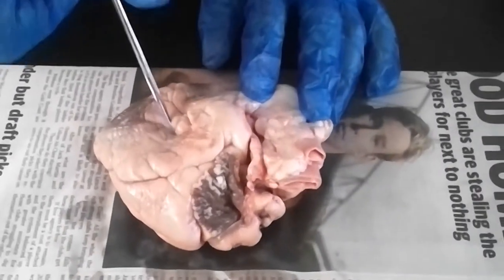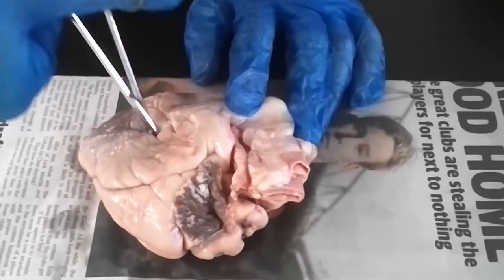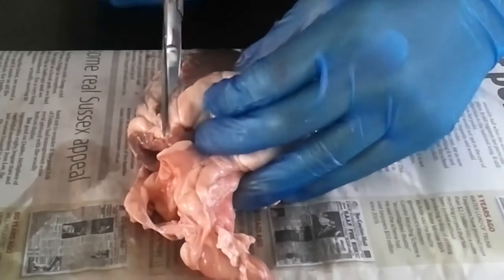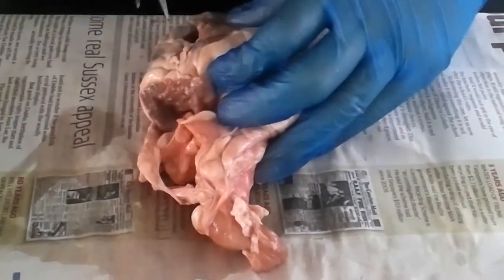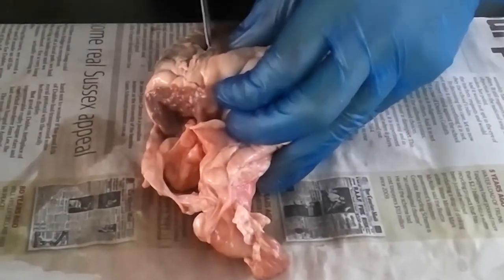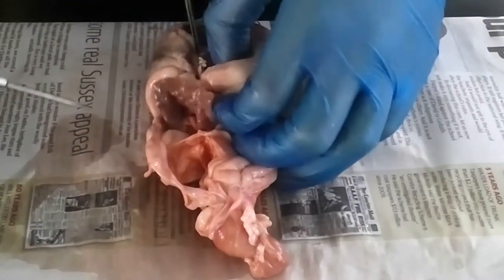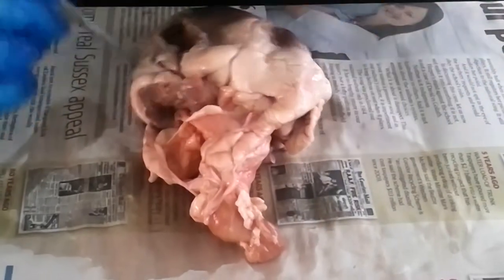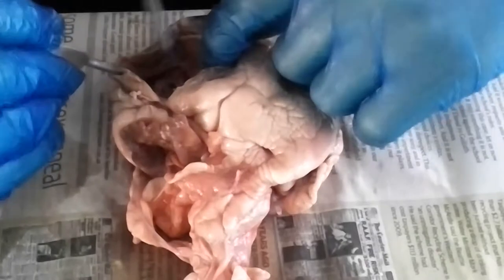So do I just do a little cut or like a proper cut? Maybe we should cut down a bit further. Just making one long incision like the board. So if you're a bit stuck looking at the board, that's fine, that's what we're aiming for. Maybe cut down a bit further.